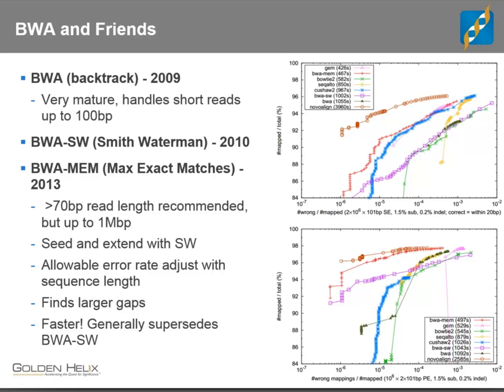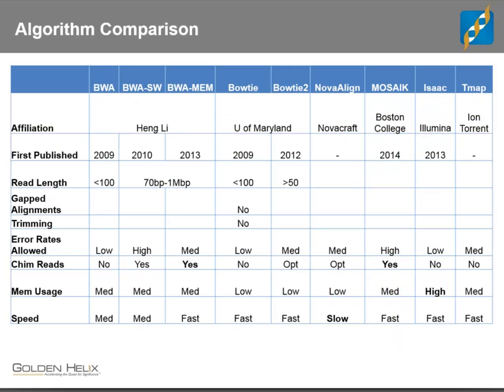So really, again, there's a lot of choice in terms of speed versus accuracy here. So here's my best effort to do a breakdown of what are probably the algorithms you're most likely to run into. We already touched on the BWAs. Again, BWA-MEM and SW can handle those large reads. The other thing that they can handle is chimeric reads. So this is essentially one read that might go to multiple chromosomes or multiple places on the reference sequence that are megabases apart.